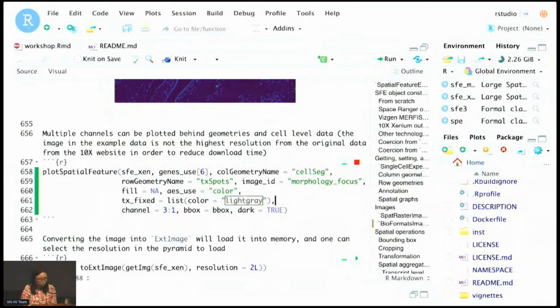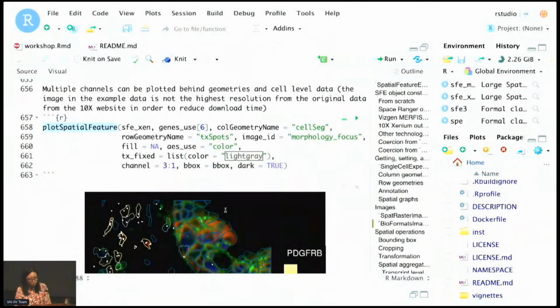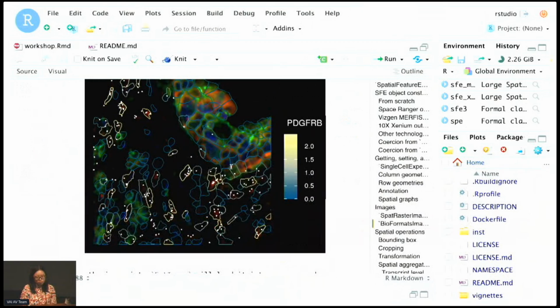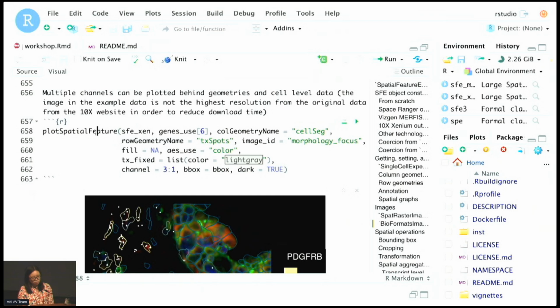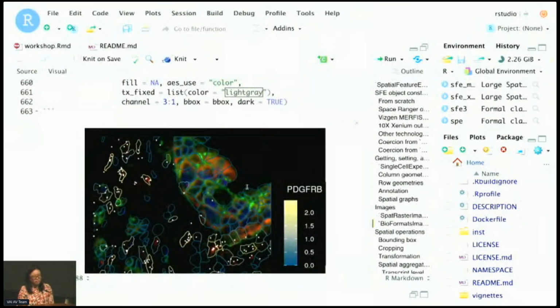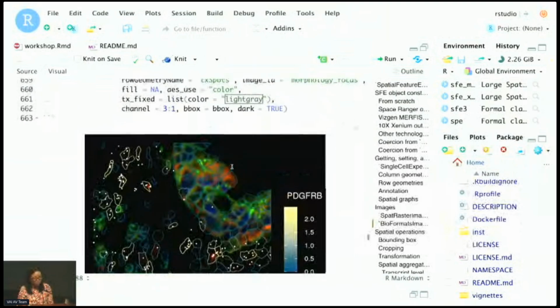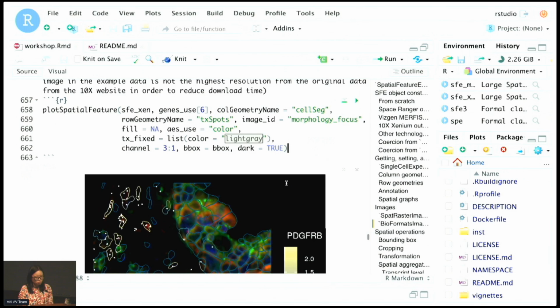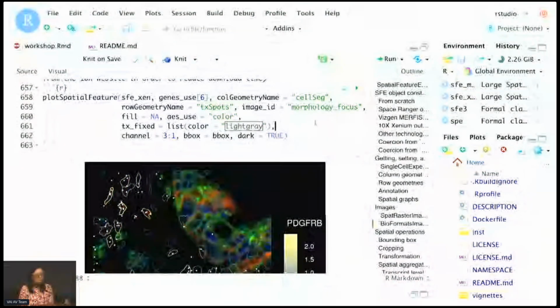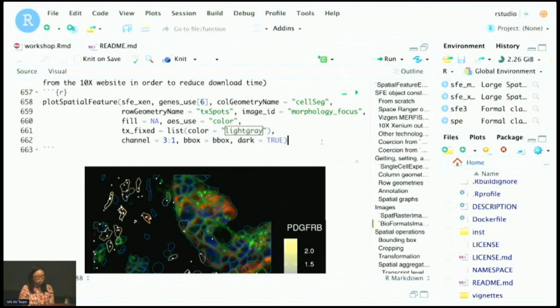I mentioned it's a pyramid, and in plotSpatialFeature and all the other plotting functions dealing with images in Voyager, there's an argument that limits the number of pixels that can be read into memory. Then this function will get the metadata and automatically determine the highest necessary resolution from the pyramid to be read. So unless you're really zooming in, you're not reading the full resolution image. And even if you are, like here I have supplied a bounding box, it will only read the small part of the image necessary. So usually you don't need to read the whole thing into memory.